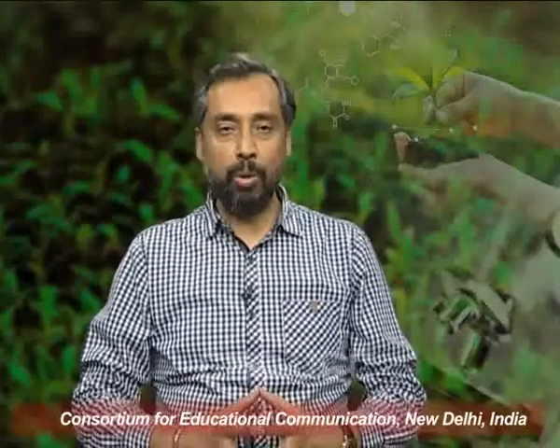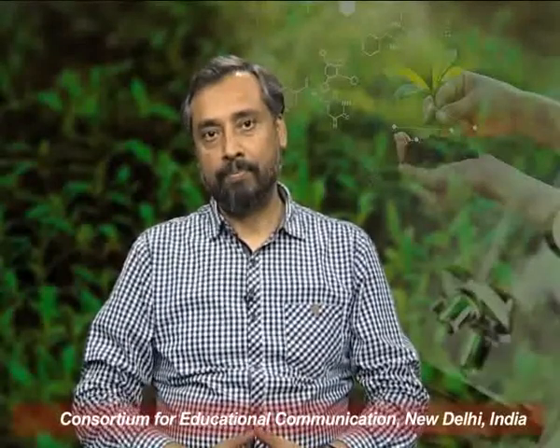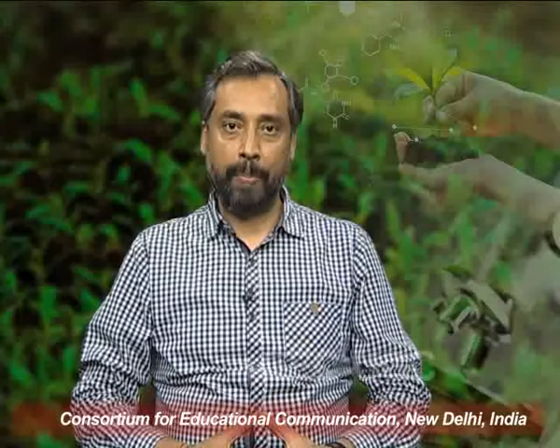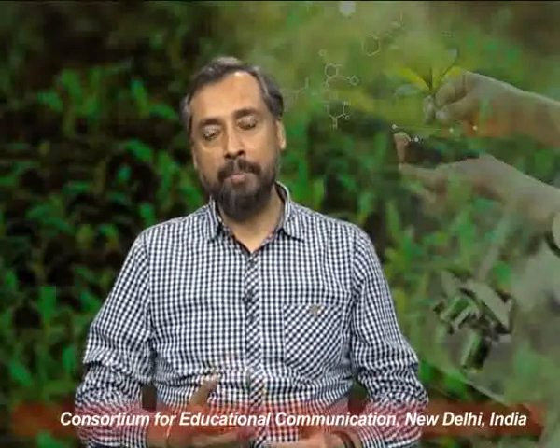Now, before we hop on to the topic directly, I would like to recapitulate and introduce to our viewers a very vital concept used in microscopy, which is called numerical aperture. So, let us first try to understand what numerical aperture is, because this concept is very vital in understanding the basic degree of resolution and why we require different types of microscopes using different beams of electromagnetic radiation.